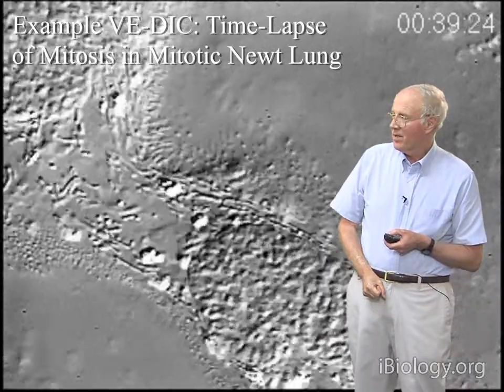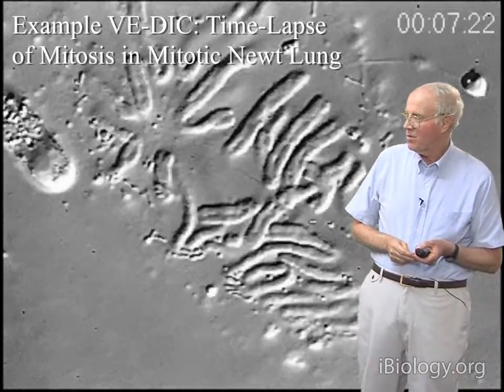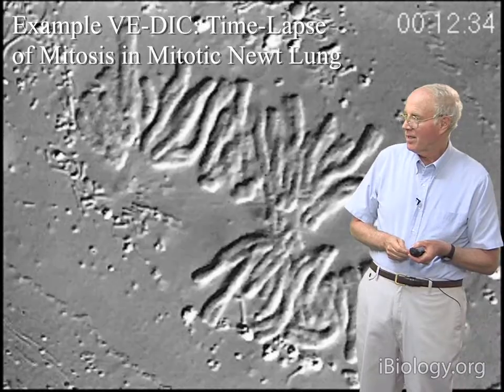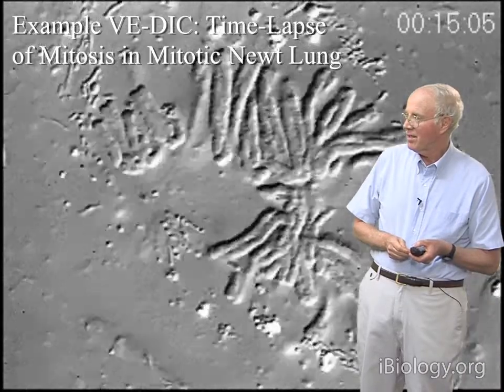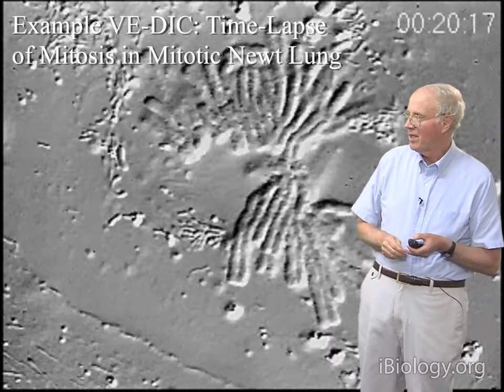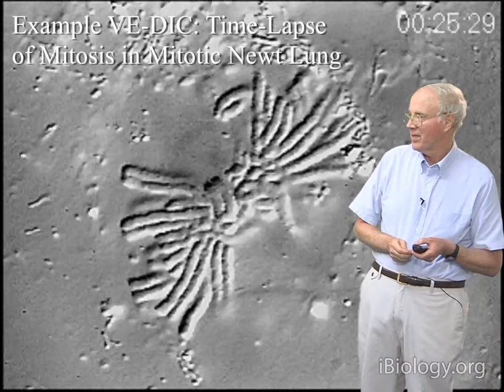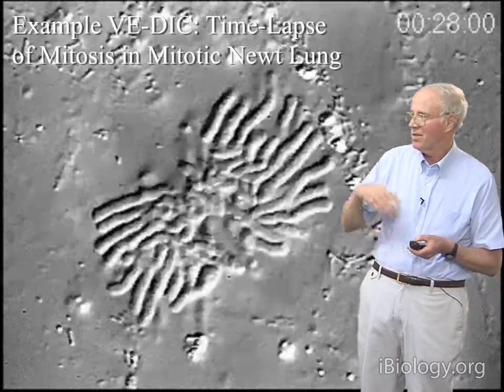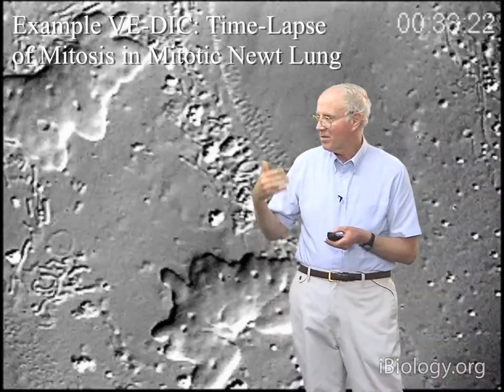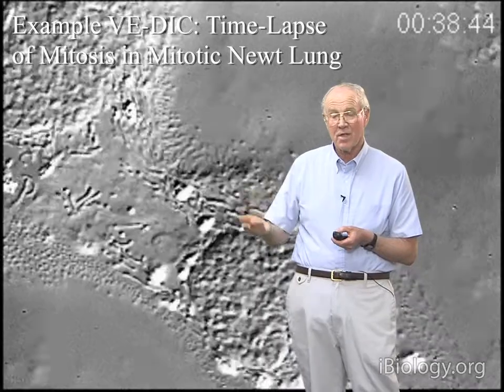And so this was used to study in great detail by our lab, actually, the movements of kinetochores and motions in cells, and define this kinetochore directional instability, their ability to move with polymerization and depolymerization of their kinetochore microtubules, a number of years ago. I think we did this by video, and every image was taken every 2 seconds, and so you could get very high temporal as well as spatial resolution.